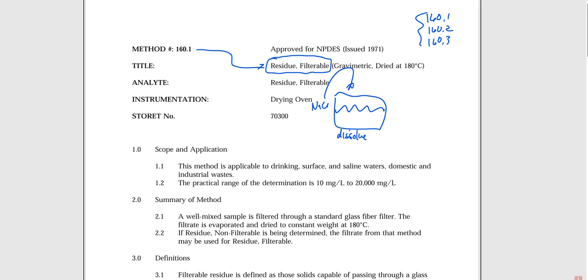So I've got this water, and it's heated, and it's dissolved the salt, and it's going to be salty like the ocean. I always look at how much salt they add in those cooking shows, and it's like a whole handful, and it gets me anxious and nervous. But okay, I'll follow it. Either way, what I'm trying to get around to is the idea that things dissolve in water. That's what this is all about.